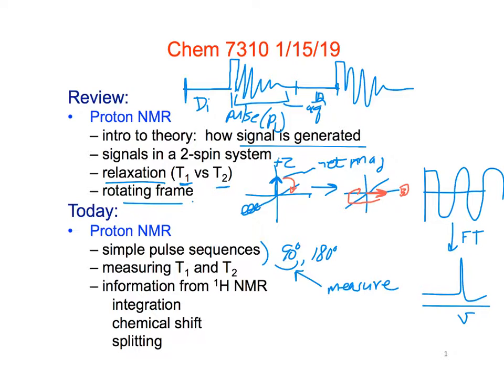If you go down and run the NMR, there's a 90 degree pulse width that's already stored in the spectrometer that it would just use. But if you had an important sample and you wanted to run a two-dimensional experiment, you might want to measure this yourself. Or at least we'll know how it is measured.